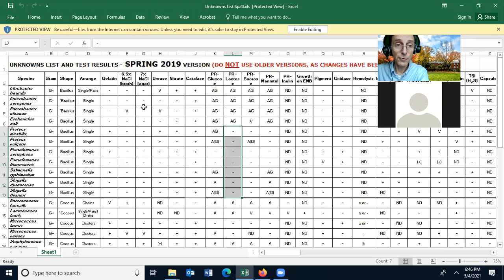Anyways, if you do the gram stain first, and you don't actually get a choice in this matter, you would then split it down to this part of the chart or that part of the chart, and then you do PR lactose. If it's gram negative, you'd split it down into these or those. Everyone see dichotomous logic? Any questions about that? If not, I'm going to close this.